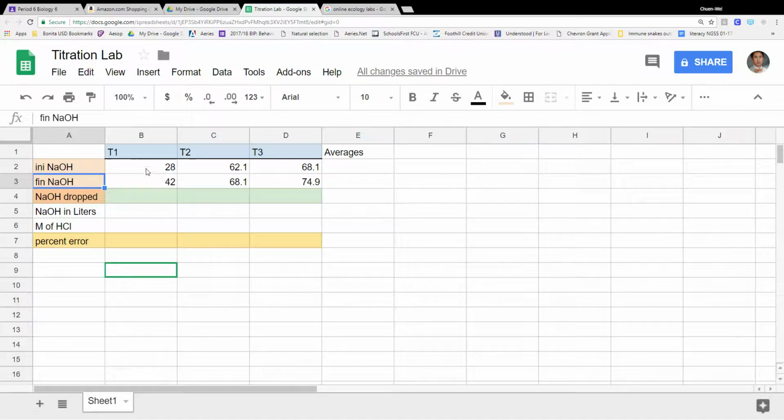So I've already done a lot of things. Here is my raw data. You should just punch that in. Here are my trials, and along here, I have put in my little titles. If you notice, these aren't the exact same titles from our lesson on Friday. That's just because I wanted to write in better titles. Like instead of initial HCl, I put in initial NaOH because that's actually what we dropped in. I made a mistake on Friday, is what I'm saying.